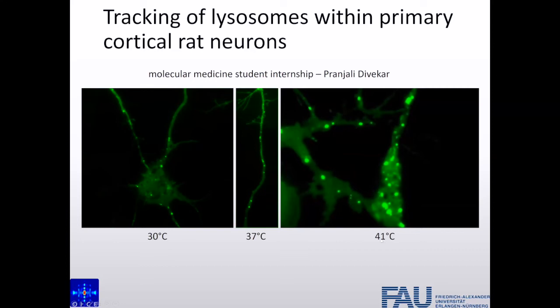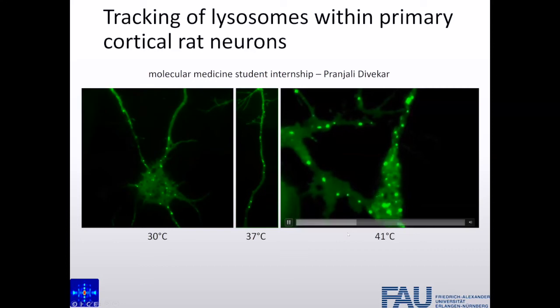And if we increase the speed, the lysosomes are moving faster. This is now at different magnifications, and I'm sorry about that, but you can already see that there's much more movement. They don't move in one direction, they probably also start to wobble around. And this was already, we think, a difference of 11 degrees, and we see a lot of difference in the movement.